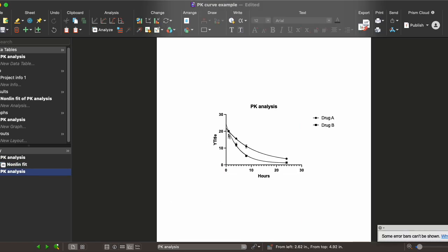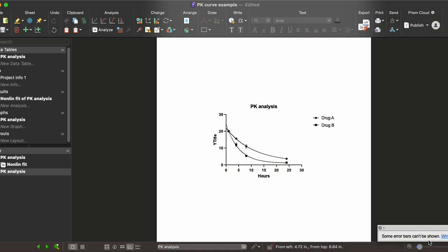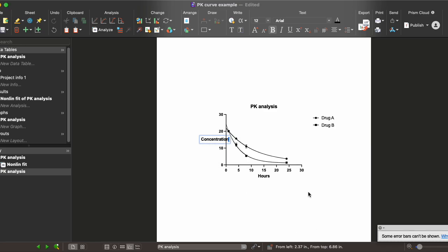Here we have drug A with the circles and drug B in the squares. You can change the increments at which the x-axis is displayed — I personally like to change this to something smaller, maybe an interval of 5 instead of 10 — and you can change the y-axis title to 'concentration' or whatever it is that you're measuring.